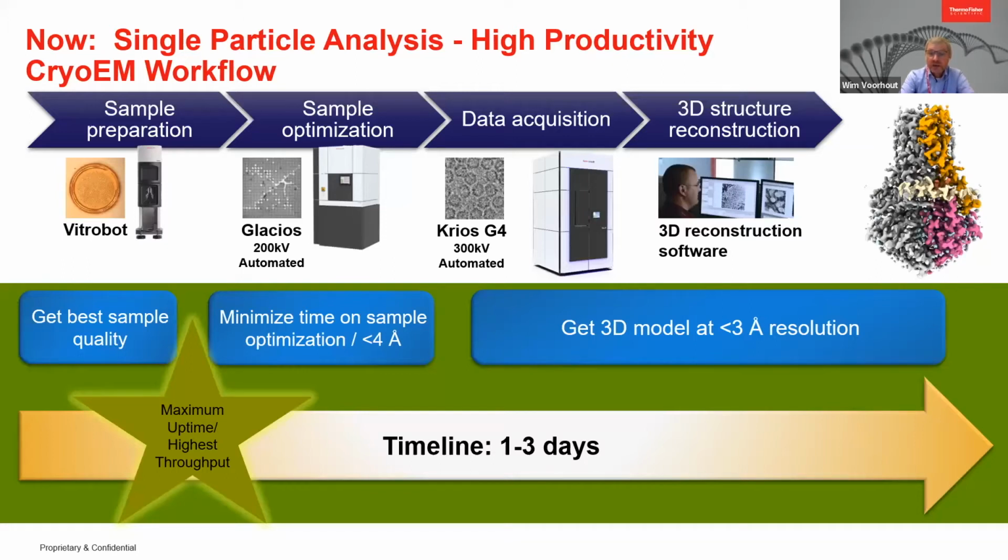On a standard sample like apoferritin, which was also mentioned in the previous talk, within an hour of data collection you can already get resolutions below 2 angstrom. So that's really revolutionary compared to 5 to 10 years back. But then when you have collected all your single particles, you still have to do quite some work to get a 3D model using different kinds of reconstruction software.